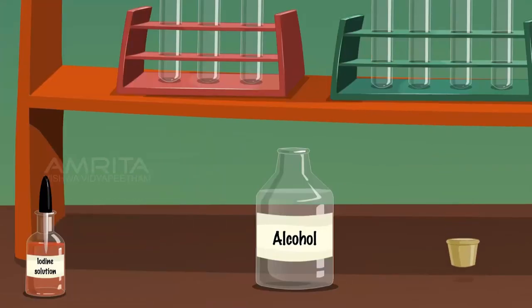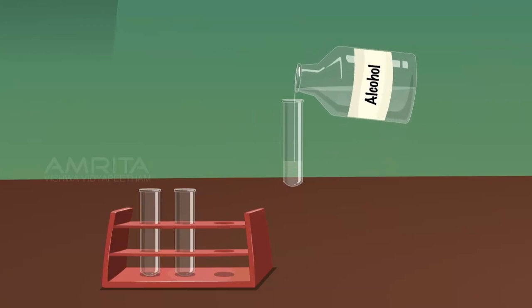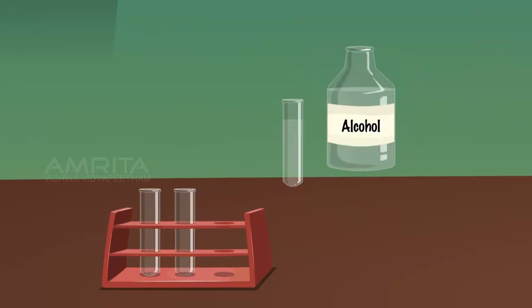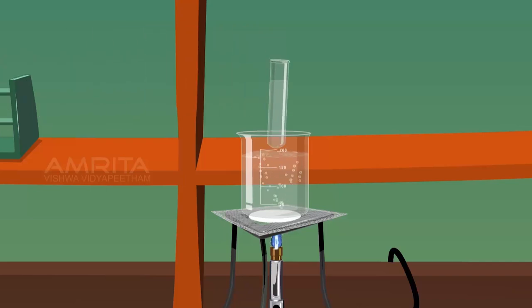Take the bottle containing alcohol and pour it into a clean boiling tube. Place the boiling tube into the beaker containing water that is boiling.